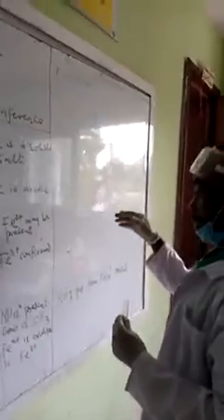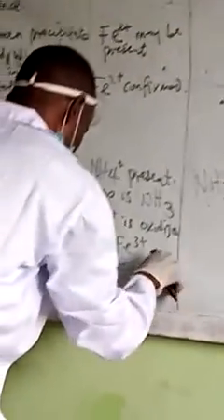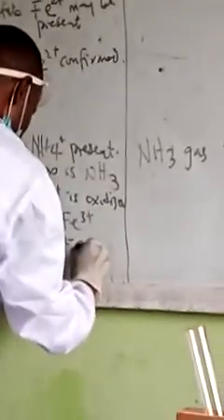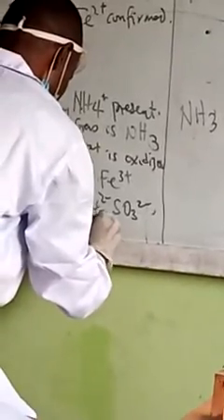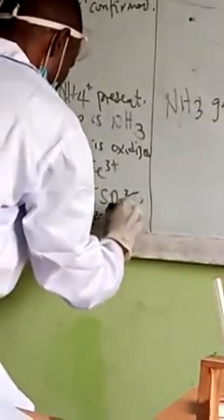So in the first place, white precipitate is formed. Okay, the inference, we have not written that. We are not yet sure. So you come to this place, you say sulphate ion, sulfite ion, carbonate ion may be present.